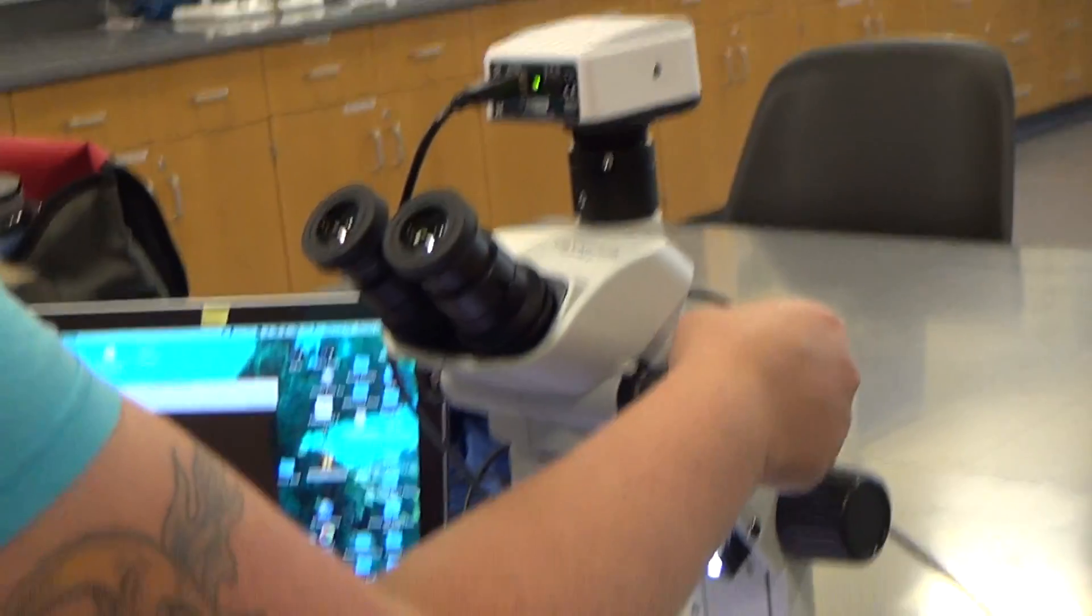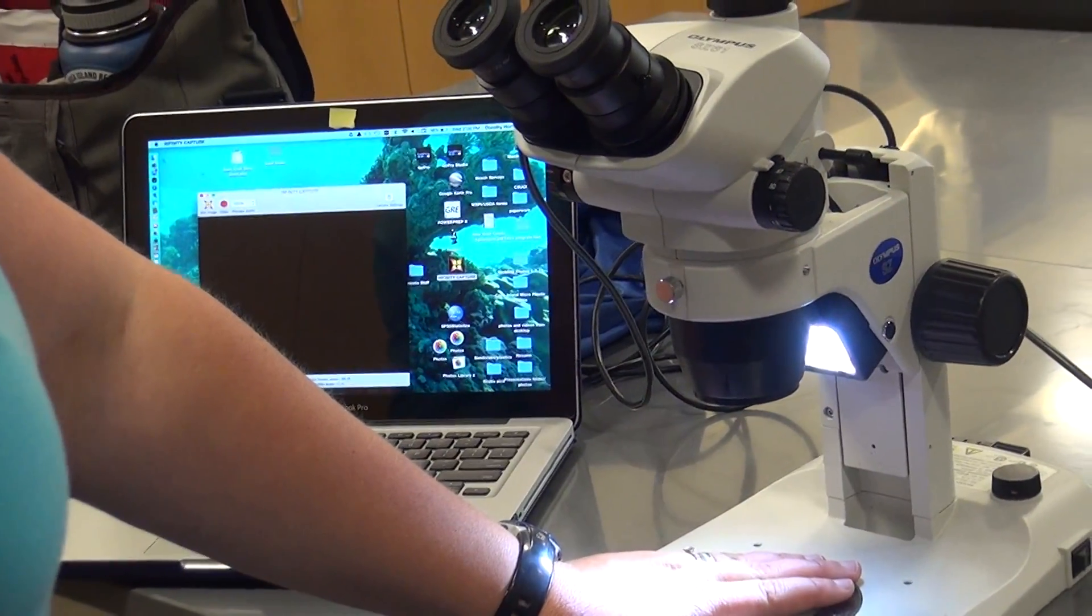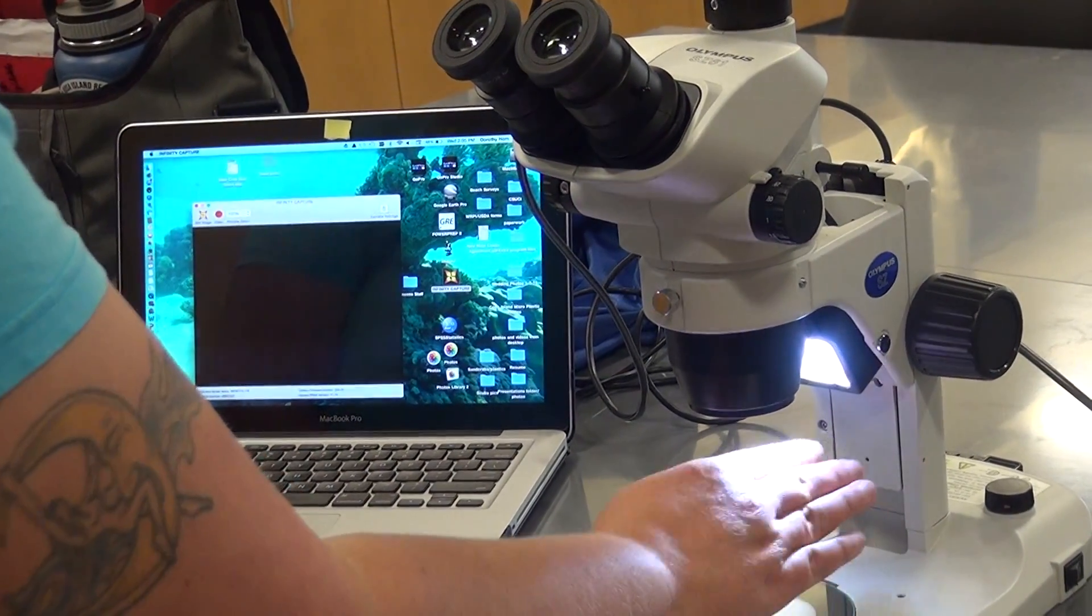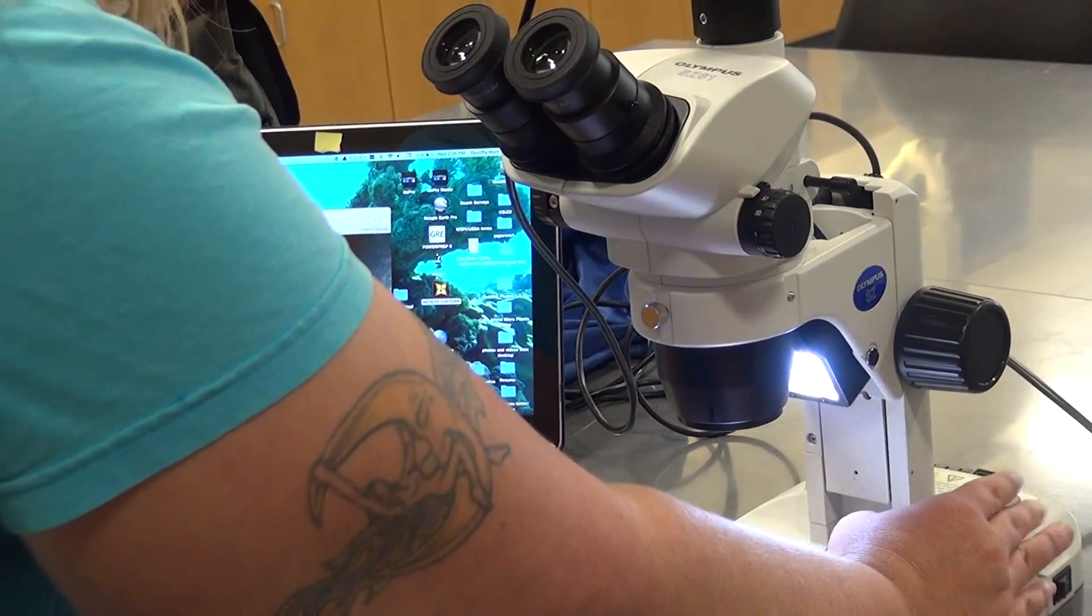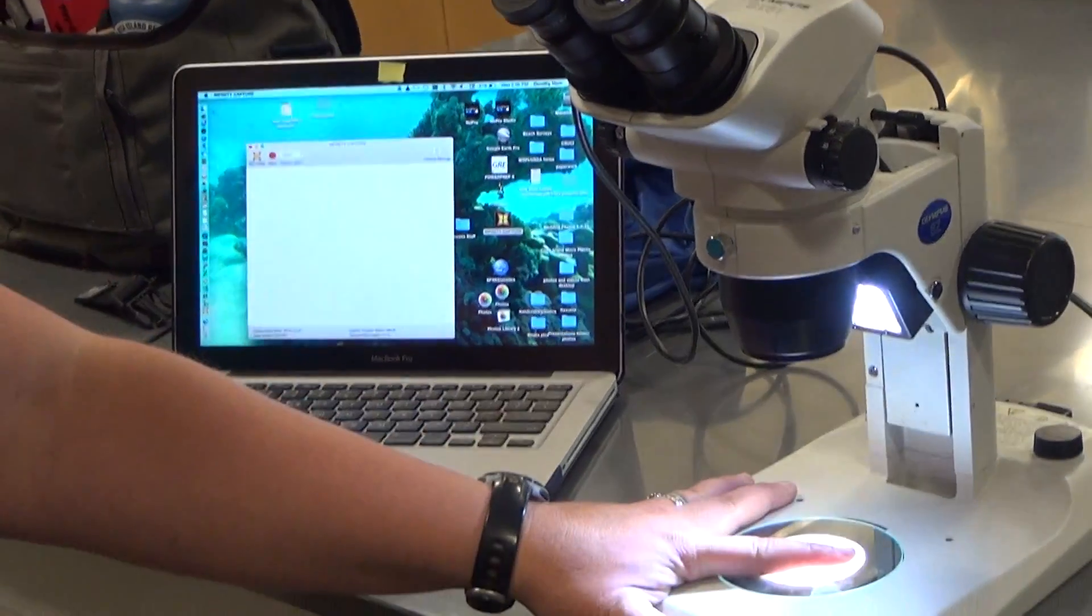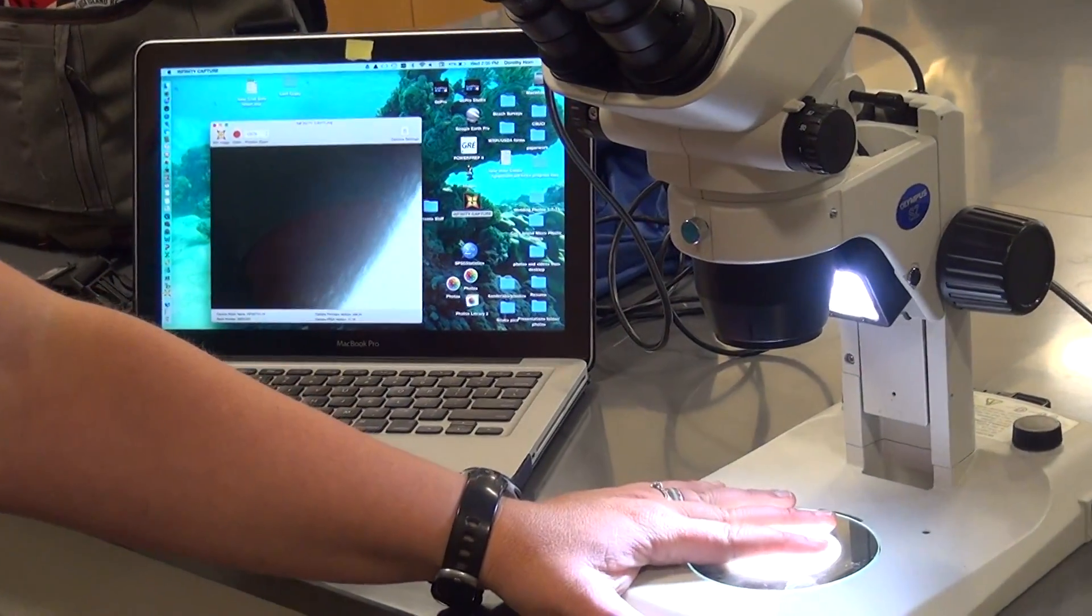So, put your specimen under there. Oh, it is there. It's just dark. There. So there is my finger, or my hand, rather. See it moving.